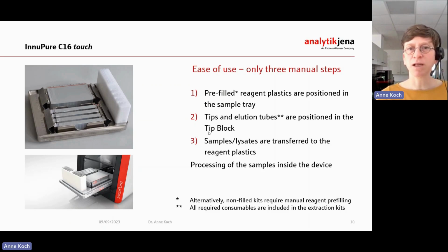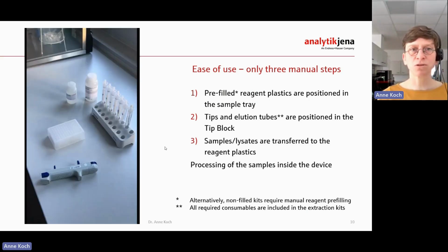And the last thing you have to do is, of course, transfer your samples to the plate so that the InnoPure can do the extraction process. And I've included 2 short videos here just to show you how you can set up.